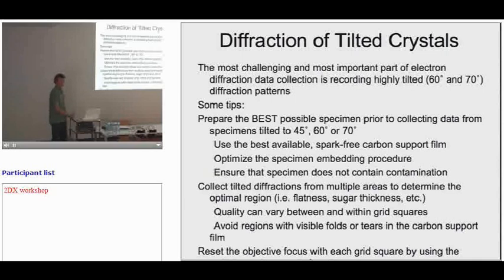Yobu gave a demonstration on how to do this earlier, and you should really test it by the light, because if you have bad carbon, you're never going to get good diffraction no matter how much time you put into it. So it's really worth it to make nice carbon at the beginning. You'll get much better data out in the end.